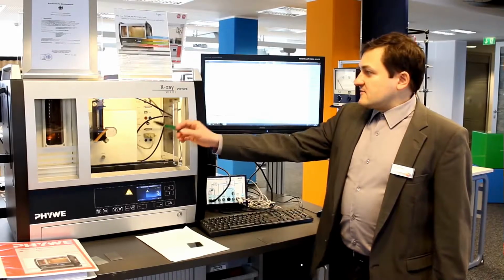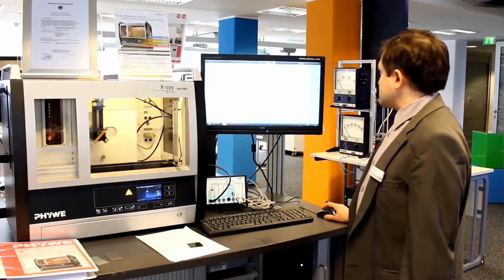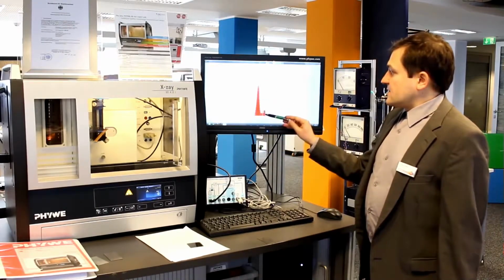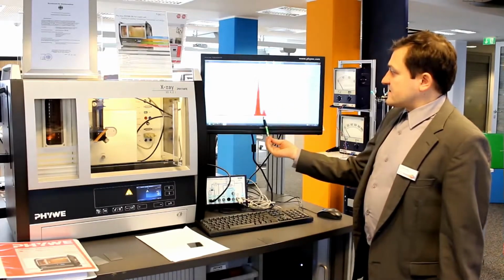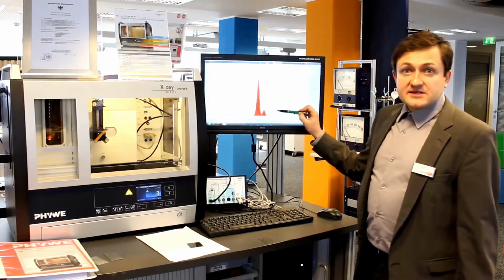Now I have a plate of pure material, copper, inside, and I start the recording of my fluorescence spectrum. Here you see the incoming photons being recalculated into the histogram, and you can see very clearly this is the K alpha, this is the K beta transition of copper.